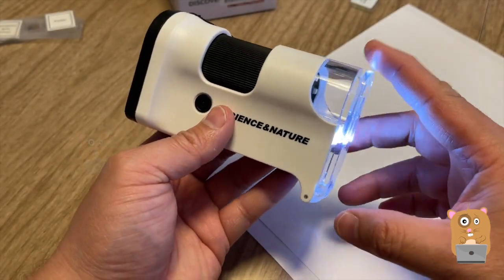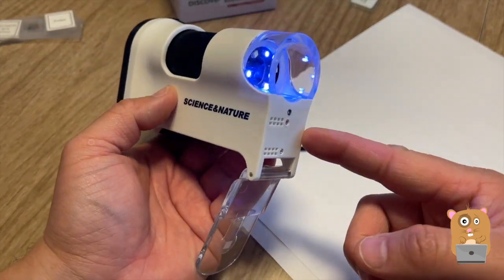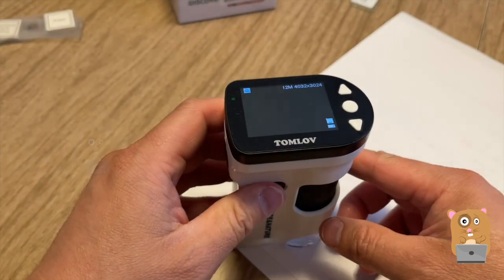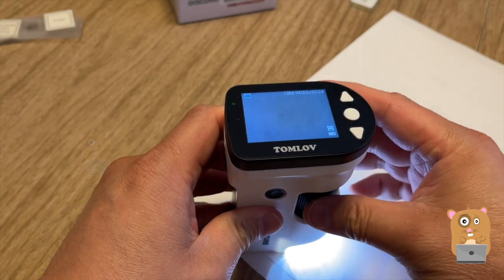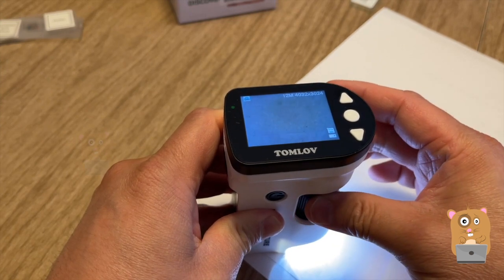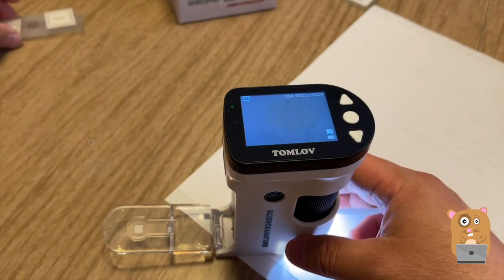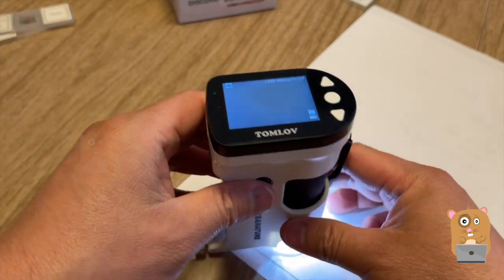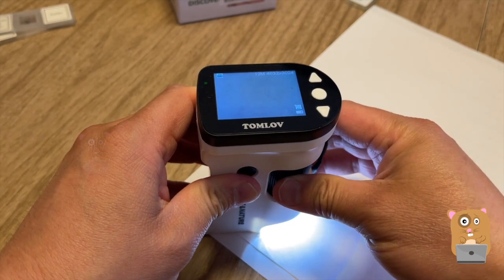If I want to inspect something other than slides, I can just open this little flap. I can choose the light I want. In this case, here's a sheet of paper — I'm going to choose the light from inside. I need to focus on this. So now I can see the fibers in this paper. But I think this is more for like a leaf, or anything where I don't have slides to contain it. I can then just place this onto the item and view it directly.